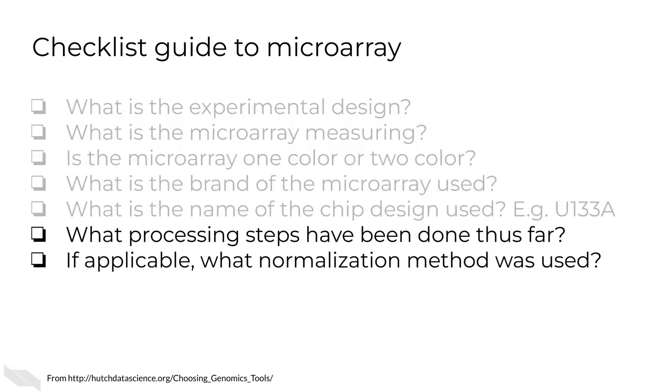Finally, make sure to ask if any pre-processing has been done to the data and what those steps were. This includes finding out what normalization method may have been applied.